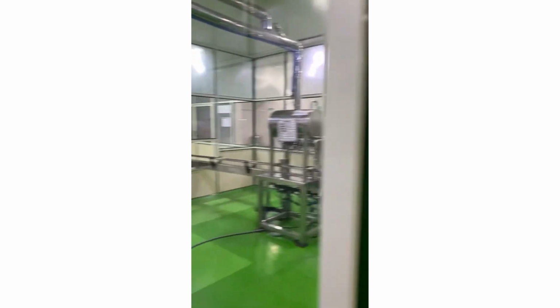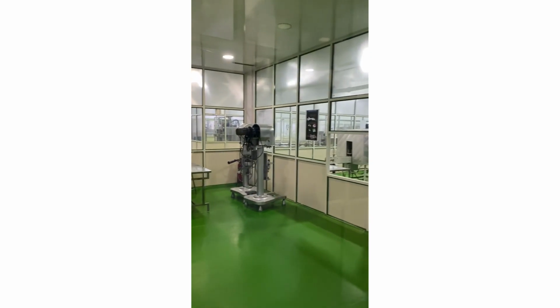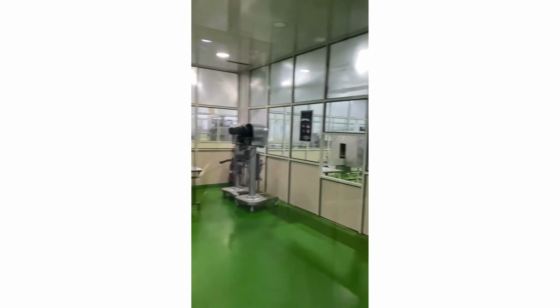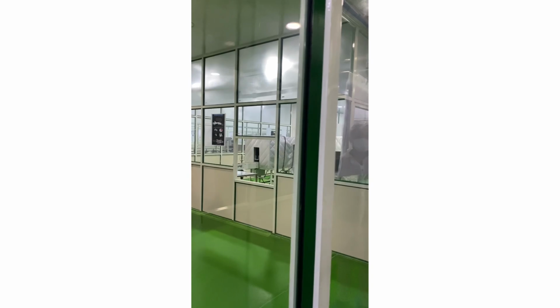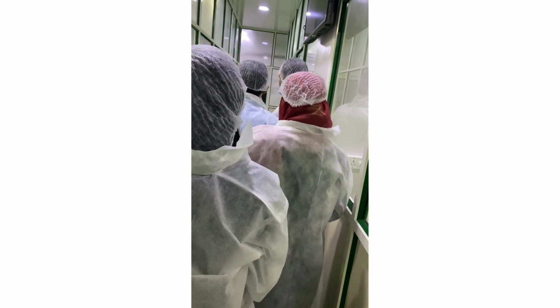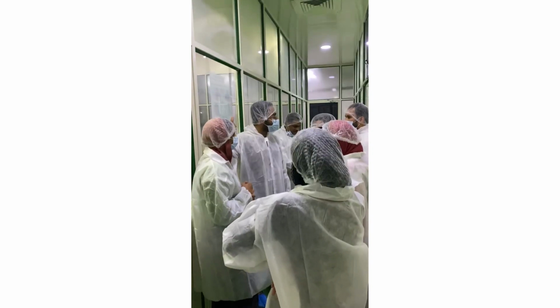The primary packing: we have 2 capping machines. The inner cap is put first, and then the outer cap, and the seal happens. Here the shrinking, primary packing and secondary packing are done. Once it is packed completely with the outer shrink, it goes to our FG godown.